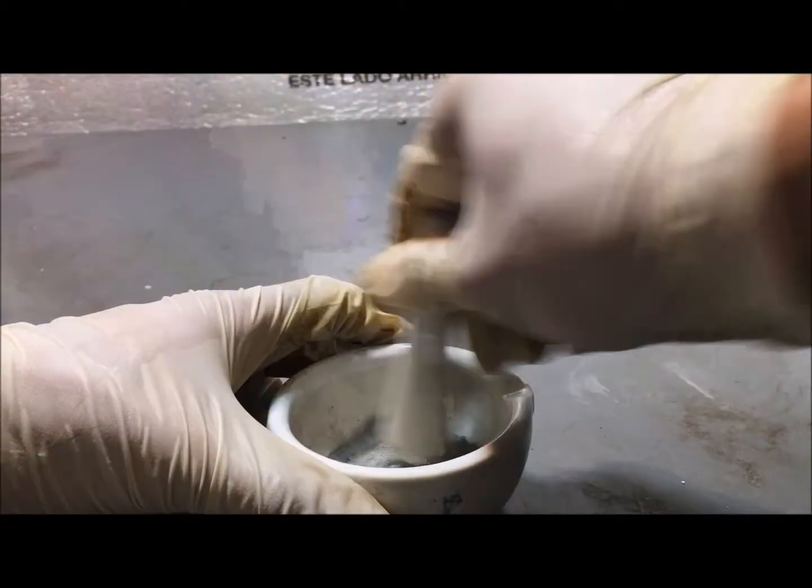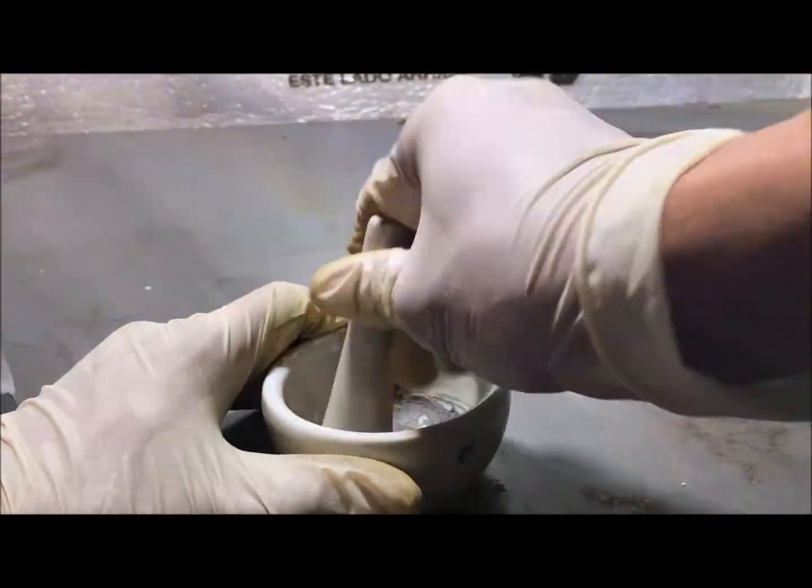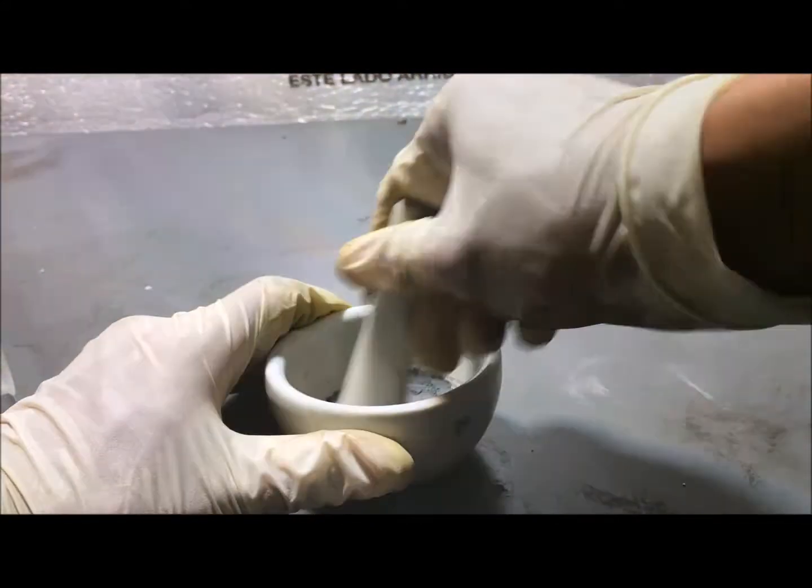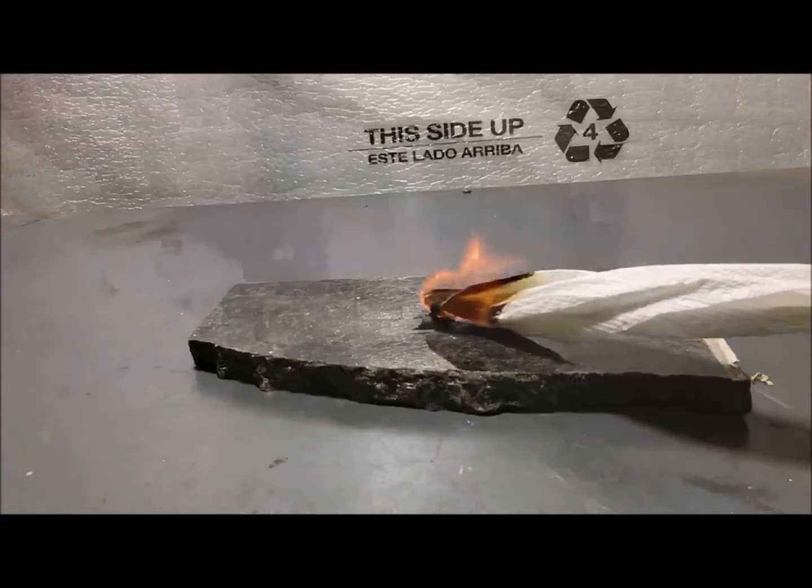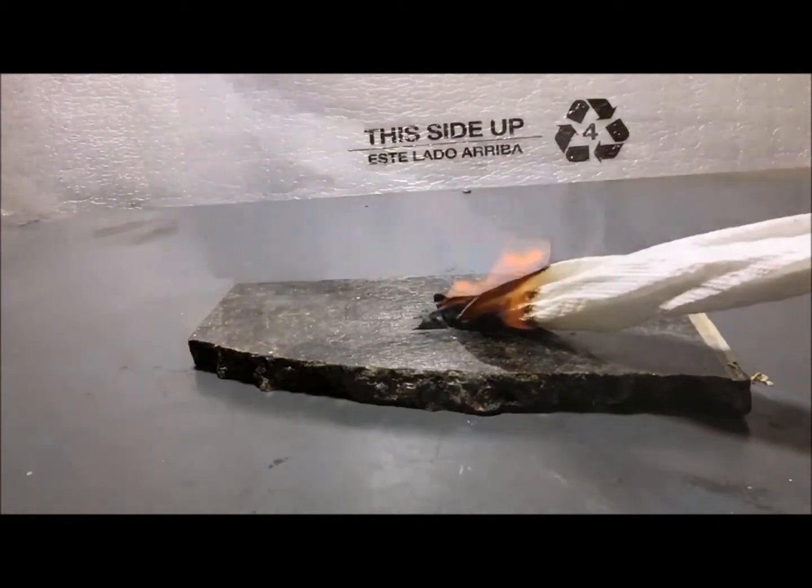To make the zinc sulfide, first we need to mix one gram of zinc metal with half a gram of sulfur. Now we simply light the mixture on fire, in order to bond the sulfur with the zinc metal.